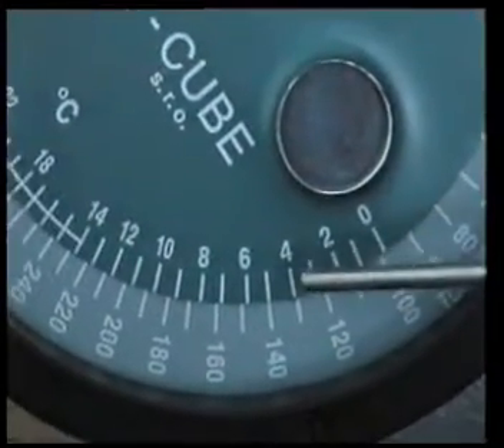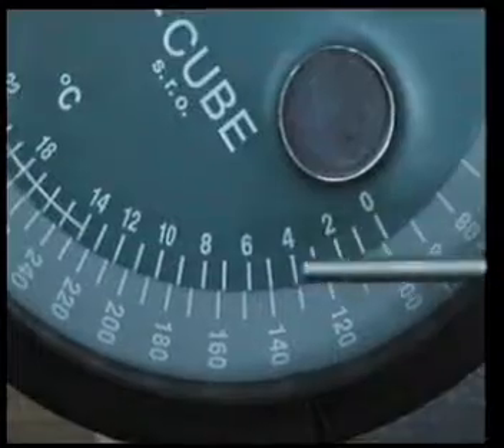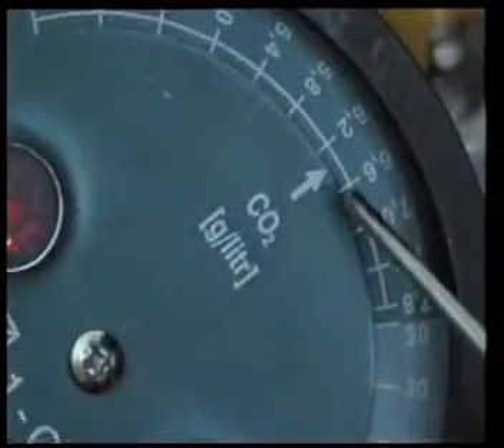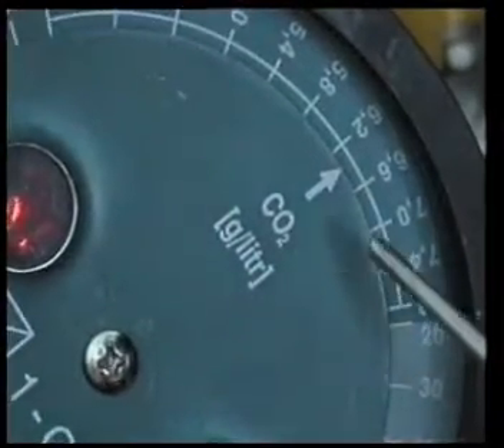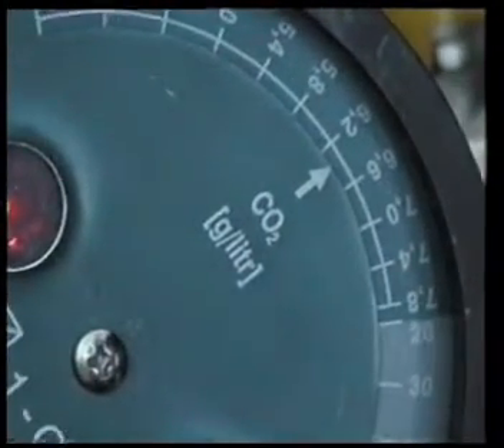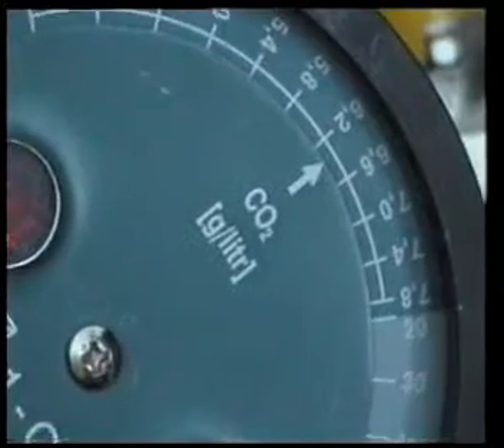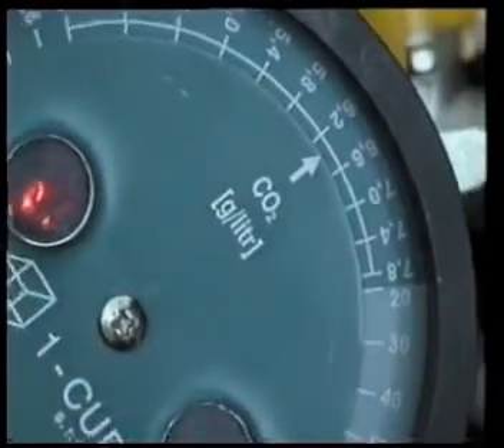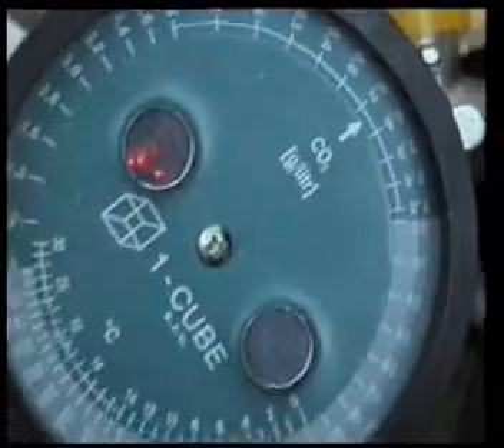As you can see, matching those two up, we look above to see that it's 6.4 grams per liter of CO2. That amount divided by 10 tells you you have 0.64% CO2 in the beer.